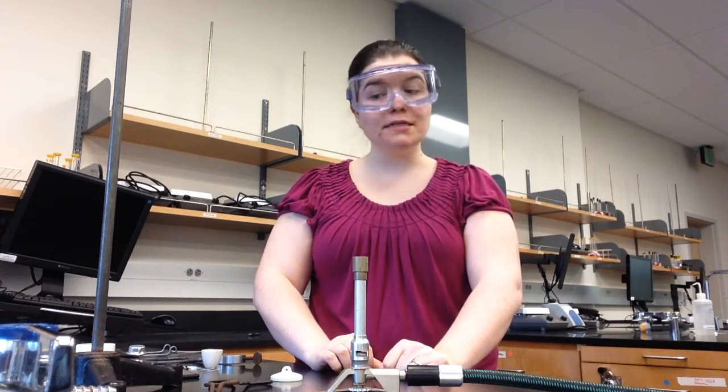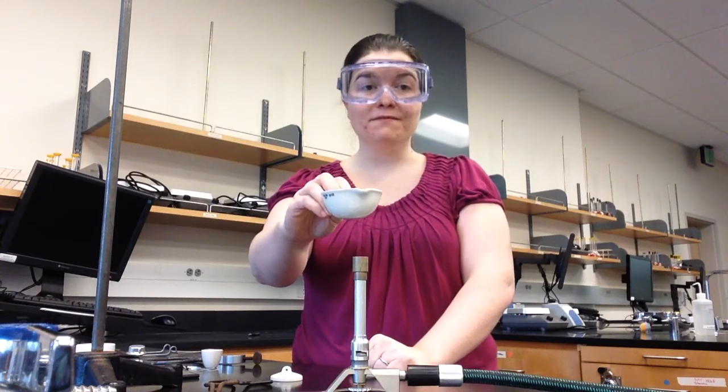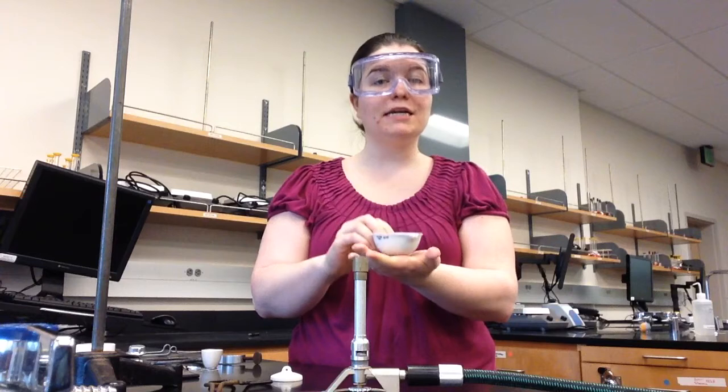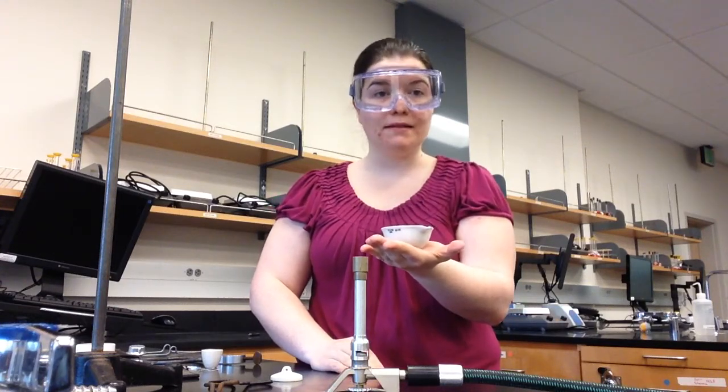In this lab, you will also need to measure the mass of the chemicals in containers that have been in contact with a Bunsen burner flame. Because they have been in the flame, they might be hot. Before you can measure the mass of a chemical in a container, you should make sure the container is cool. You should be able to comfortably hold it in your hand before you bring it over to the balance.